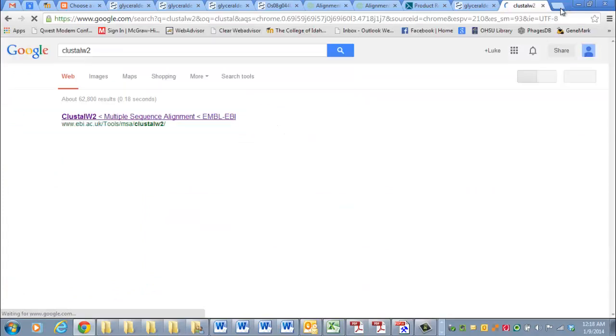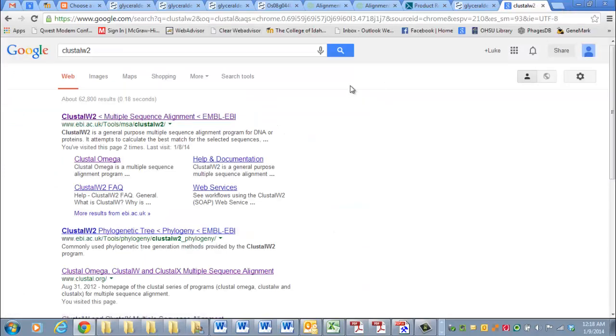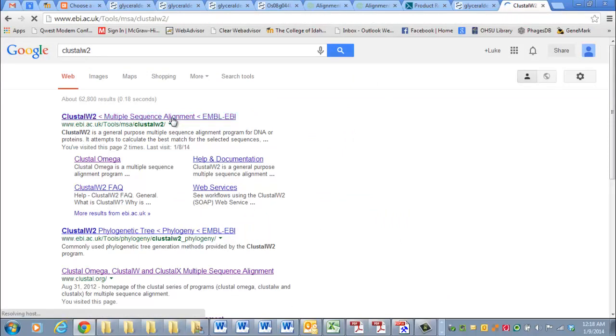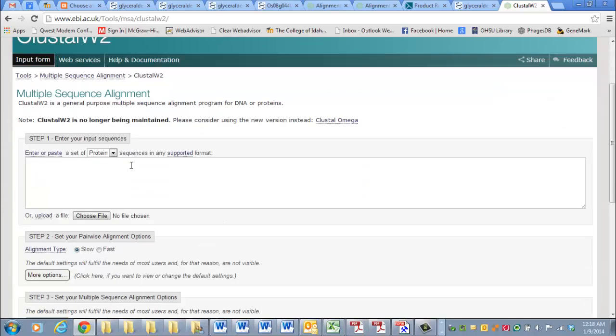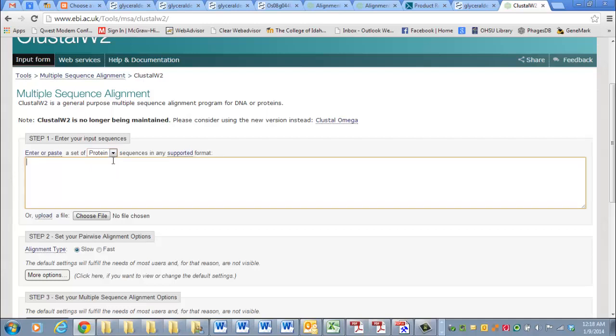and we go to Clustal W2 Multiple Sequence Alignment. We've been changing this box to DNA before, but here we're going to leave it as protein if you want to align multiple proteins.